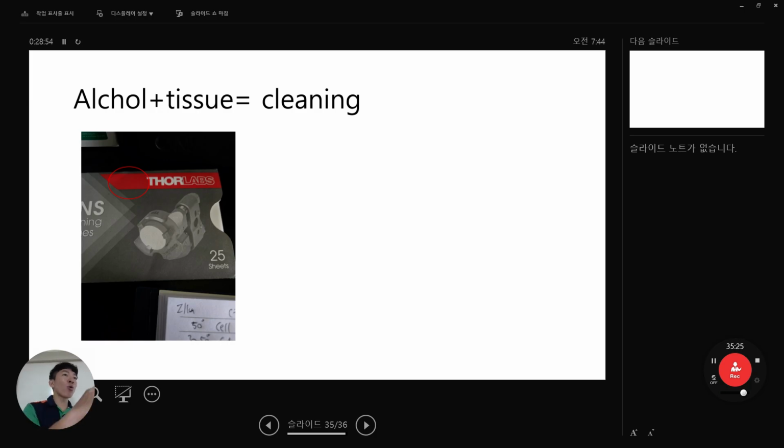Put the oil on top of the laser lens, and there on the laser lens, you put the glass on top, and then close the chamber. After you finish, you just wash that oil off using alcohol tissue. As you know, when the oil is stuck in the machine, it is a little dirty and it's not good to have it. So this is the overview of the storm imaging.